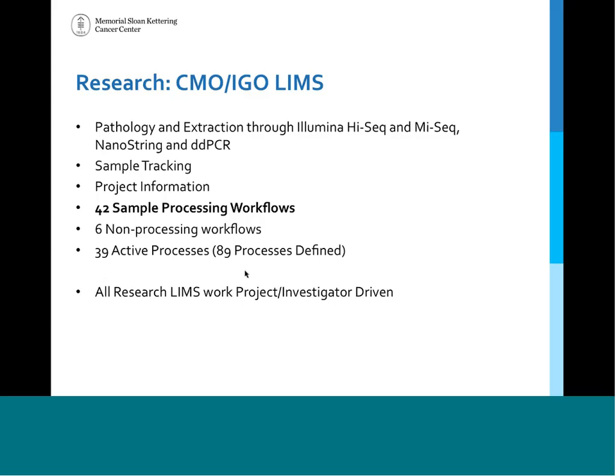And then one really big caveat to the way our system works compared to a clinical system is that all the research LIMS work is driven by an investigator request. So this means that samples, when they come into us, are grouped together in these projects, and it really drives how the samples move through our system.